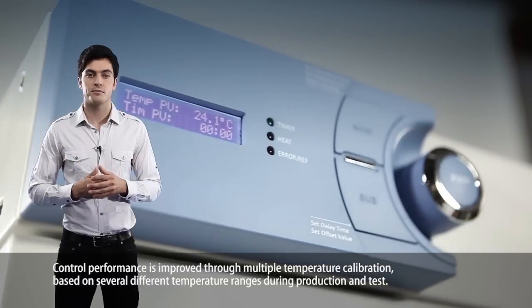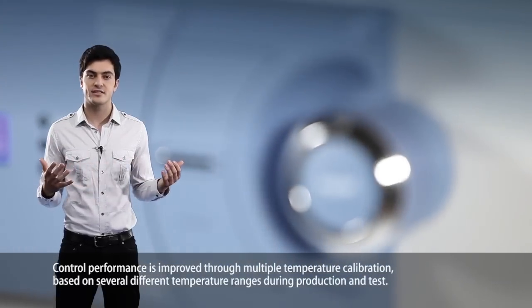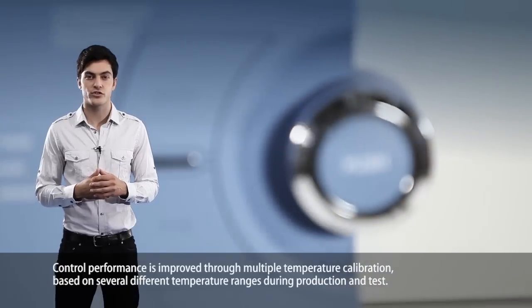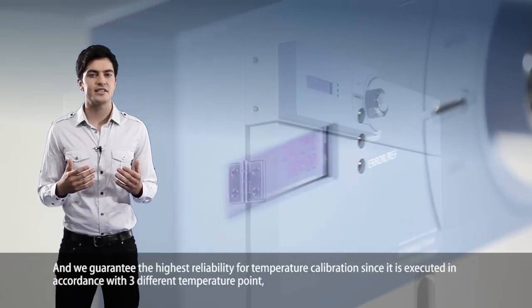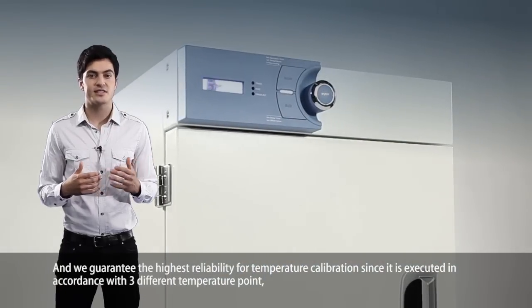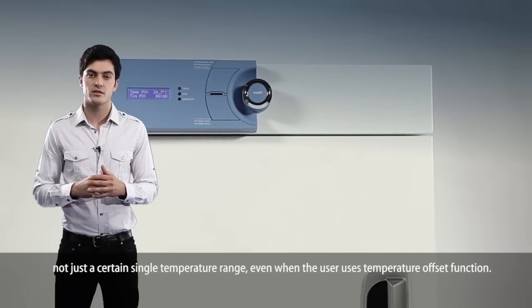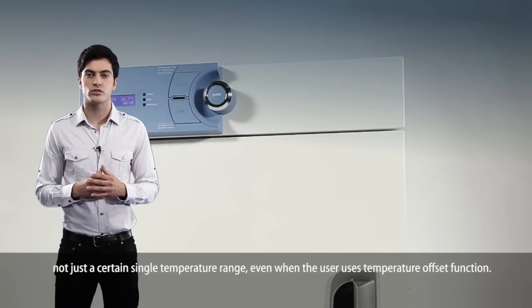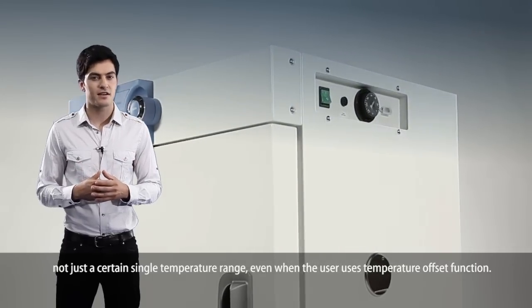Control performance is improved through multiple temperature calibration based on several different temperature ranges during production and testing. We guarantee the highest reliability for temperature calibration since it is executed in accordance with three different temperature points, not just a certain single temperature range, even when the user uses the temperature offset function.